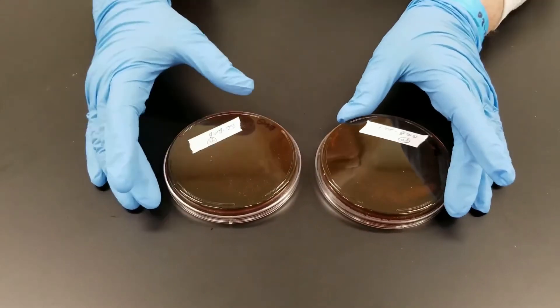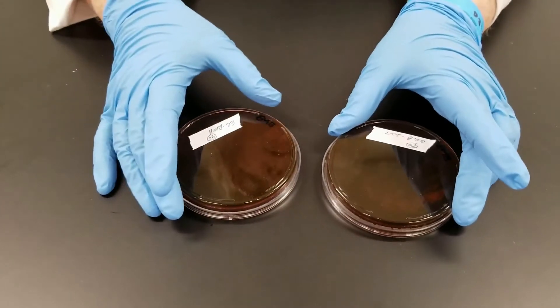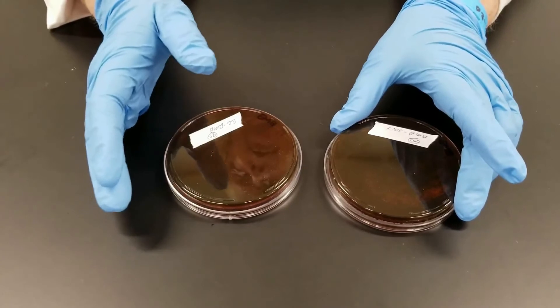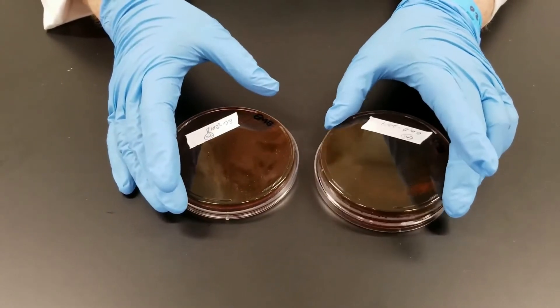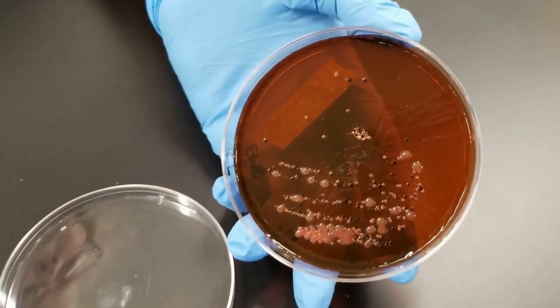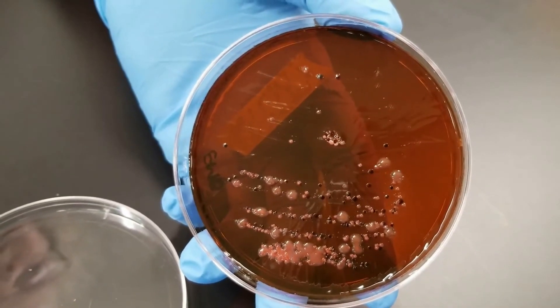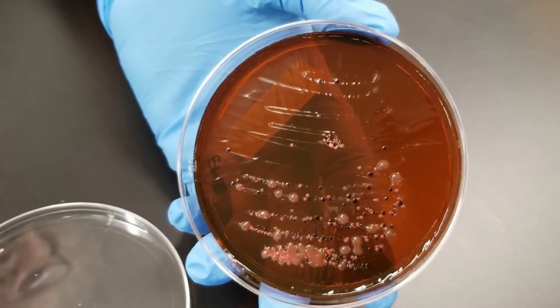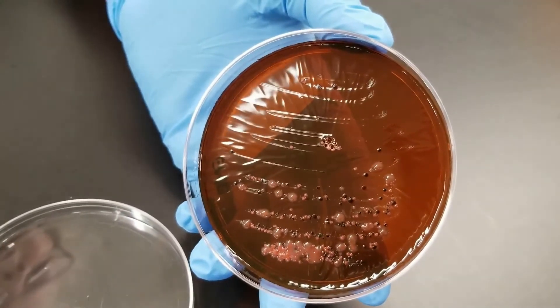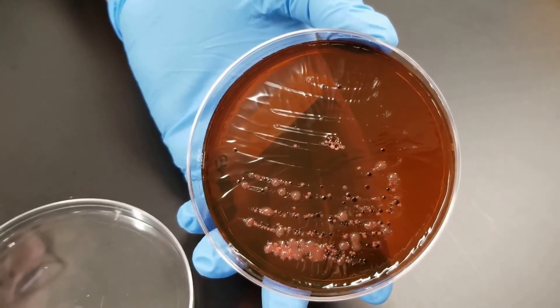This first plate is from the soil sample that we did the presumptive test with. If we look at it, you can see there are some pinkish colored colonies among several different bacteria. Those may be Enterobacter, which are commonly found in intestines, but they can also be found in the soil, on grains, etc.